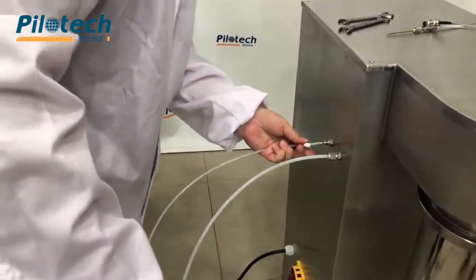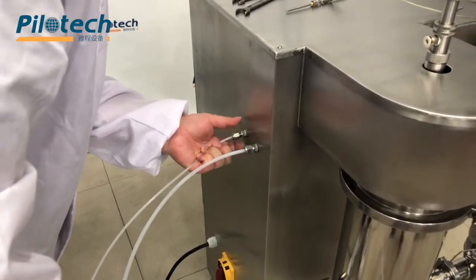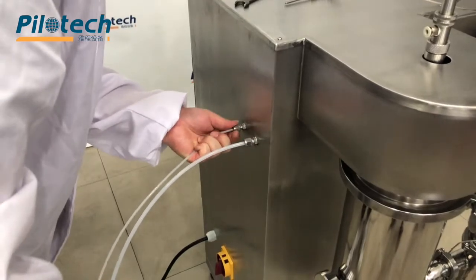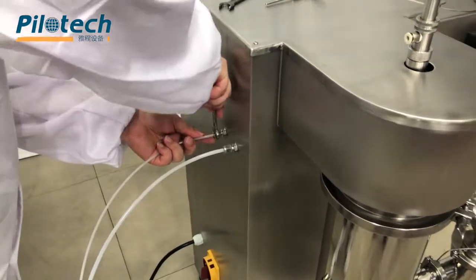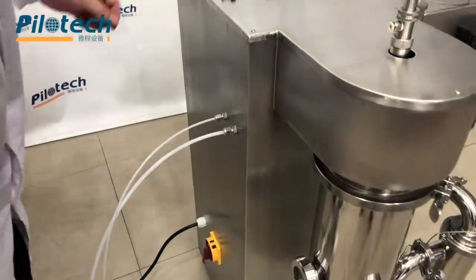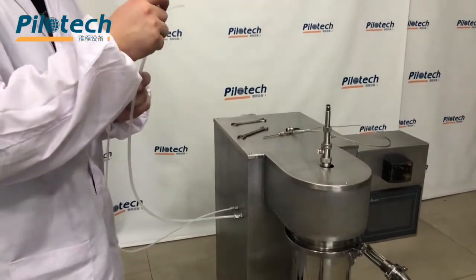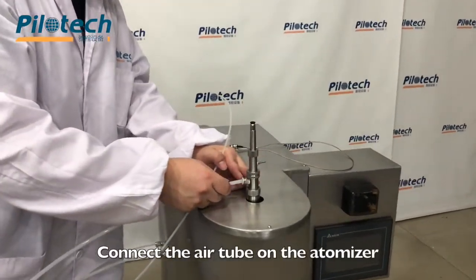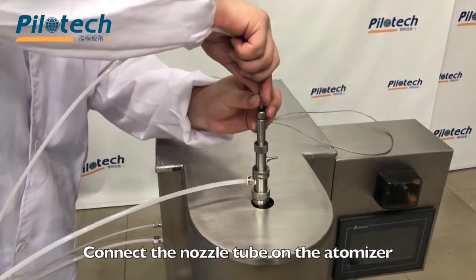Operate the air tube. Connect the air tube on the atomizer. Connect the nozzle tube on the atomizer.